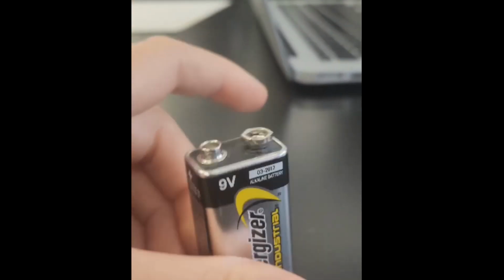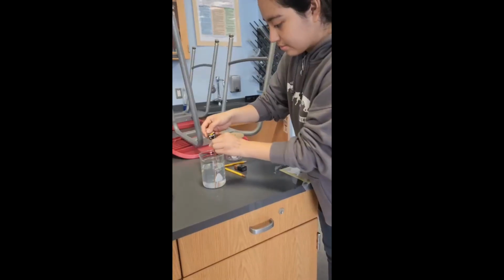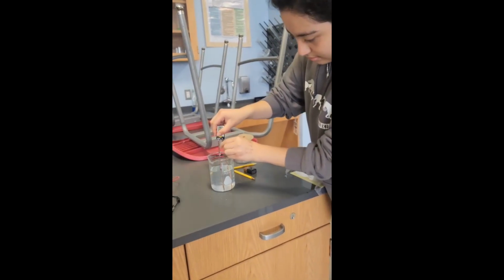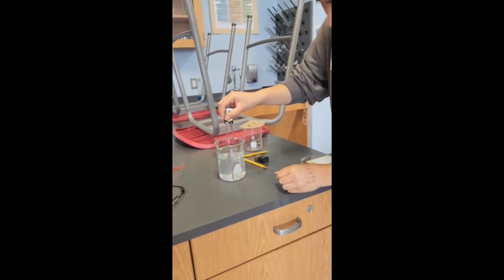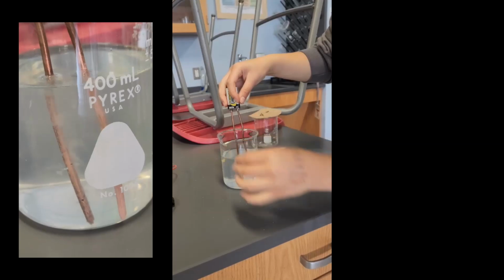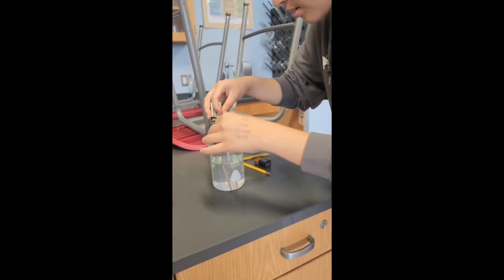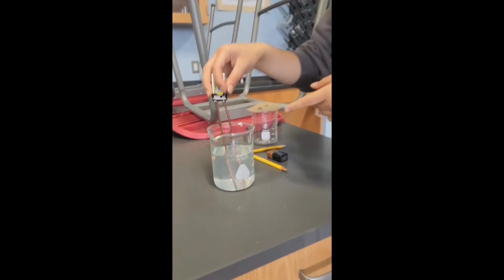By conducting a simple experiment in a lab, I was able to demonstrate a chemical reaction by separating these ions. In my experiment, I used a beaker filled with 200 milliliters of warm water and half a teaspoon of salt, or NaCl, to increase the conductivity of the water. Then, I inserted 2 copper rods, roughly the same size, into the water.